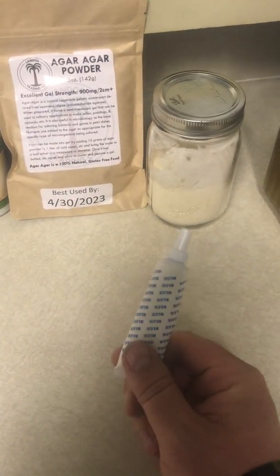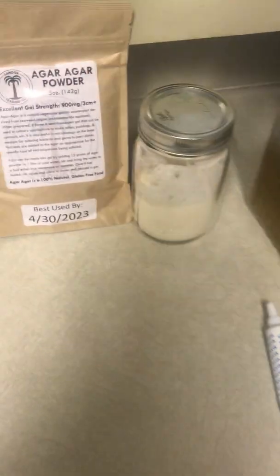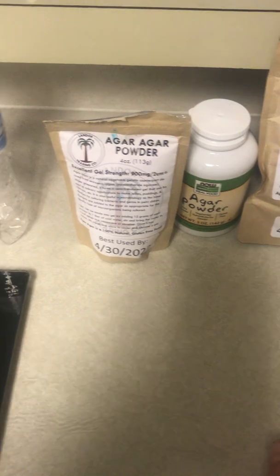Lastly, this isn't really necessary, but I like to add some food coloring to my agar plates just to spice it up and make it look cool.